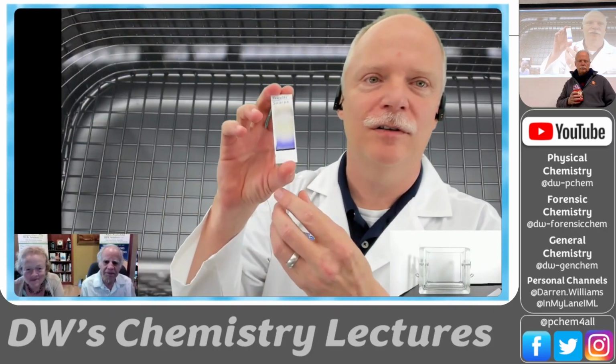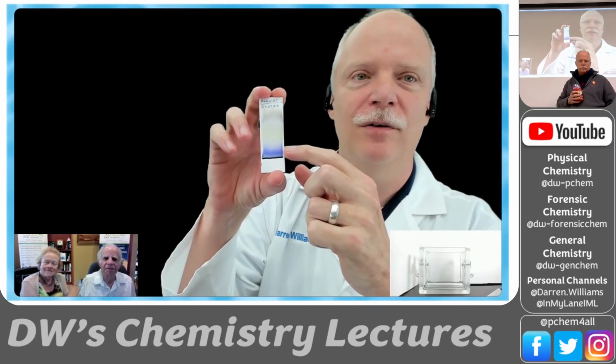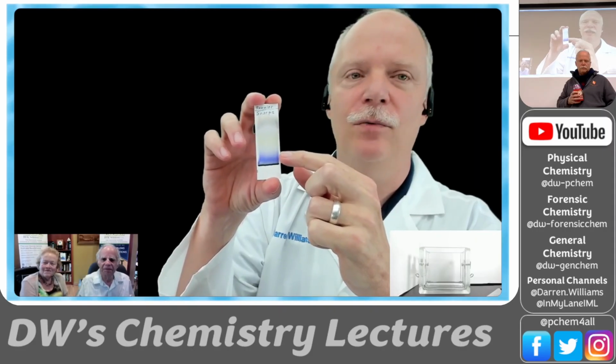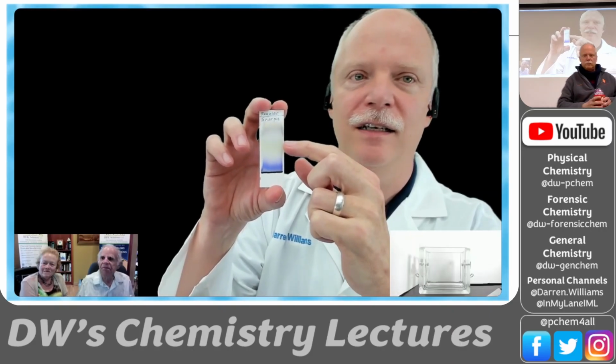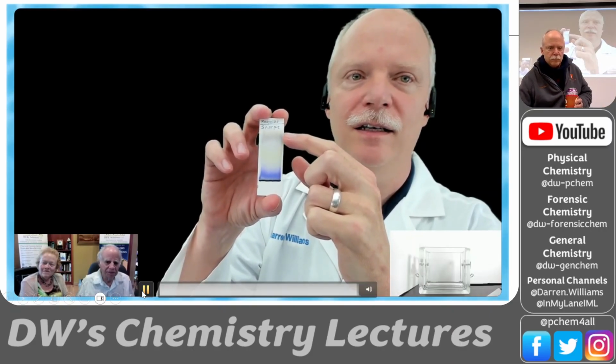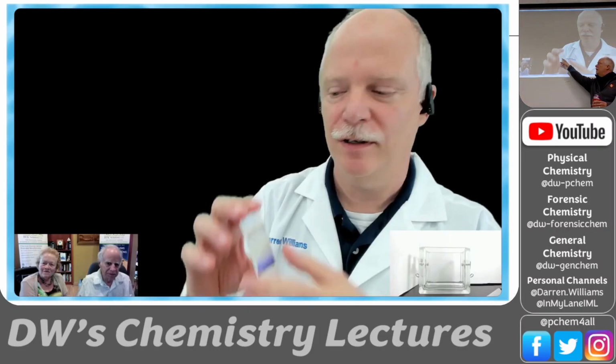It's much more colorful, and again this blue peak is not very well retained, or is retained well by the stationary phase, and then the yellow is kind of hard to see today, but it's right there. And so which of those compounds, the blue or the yellow? The blue was down here and the yellow was up here. Which of those compounds is more polar?